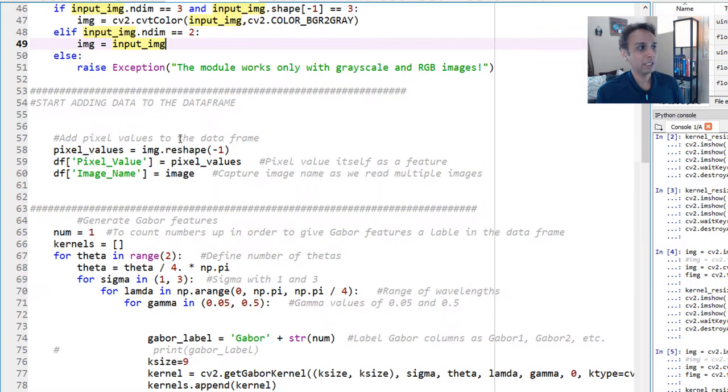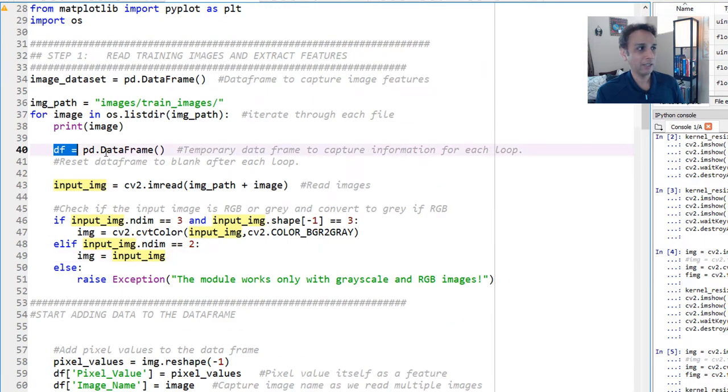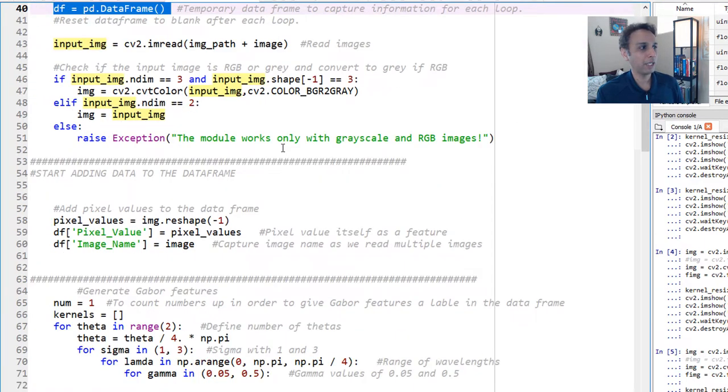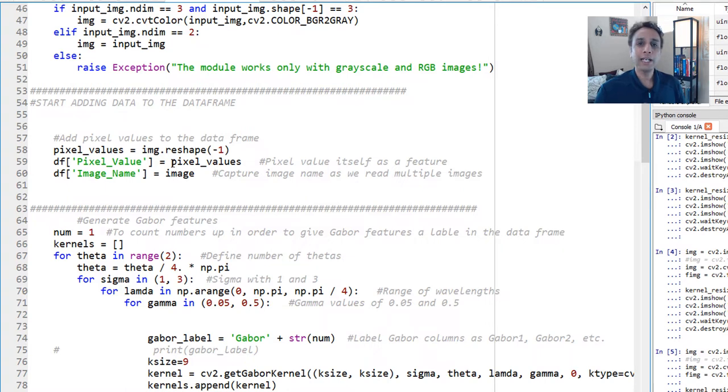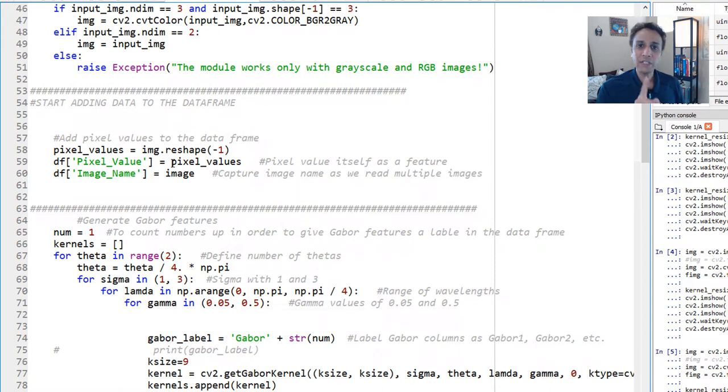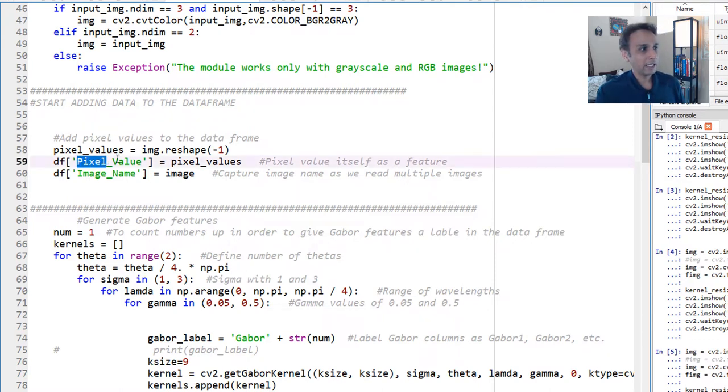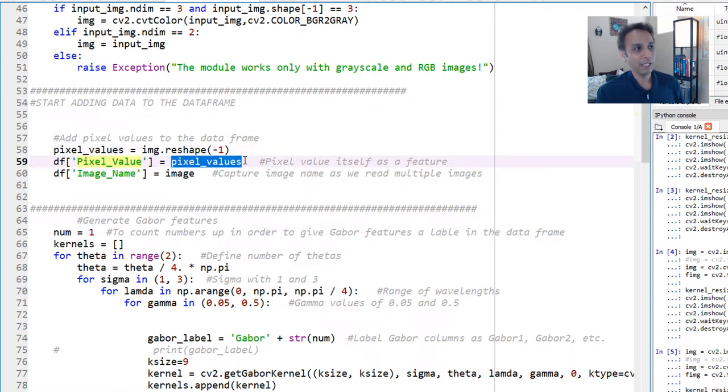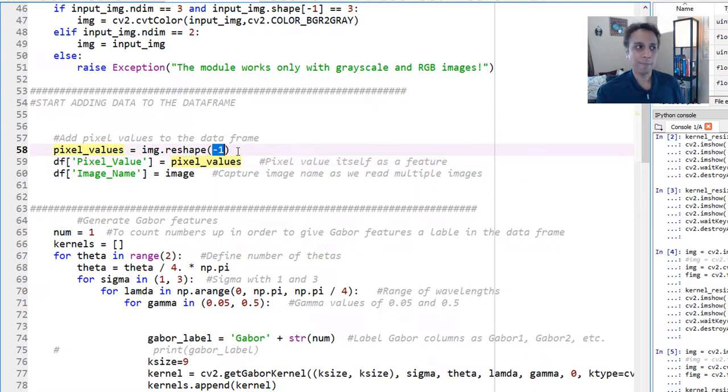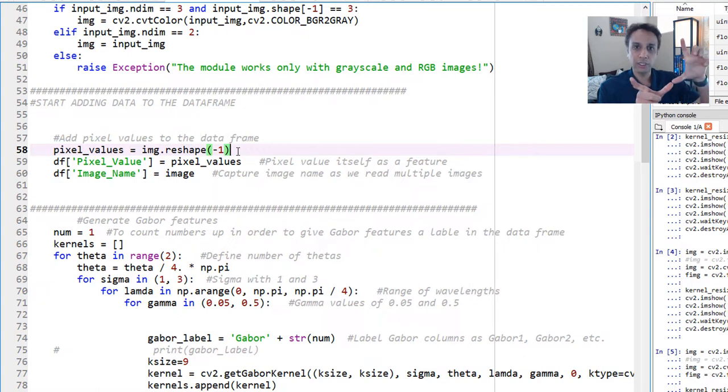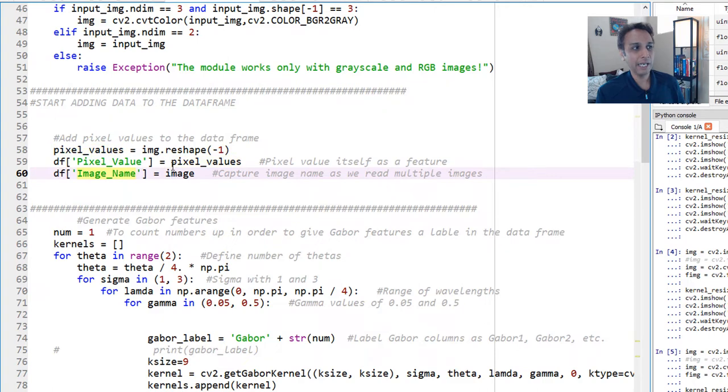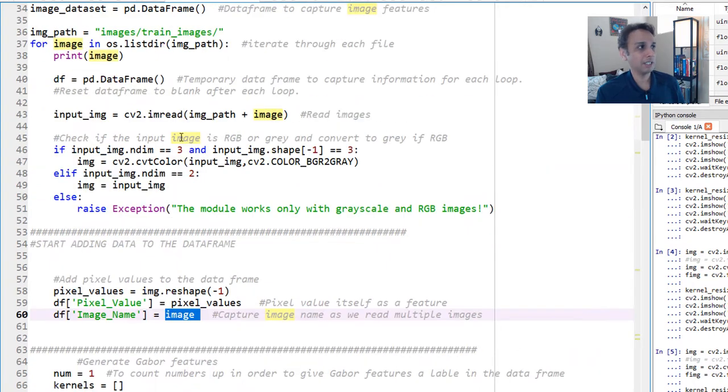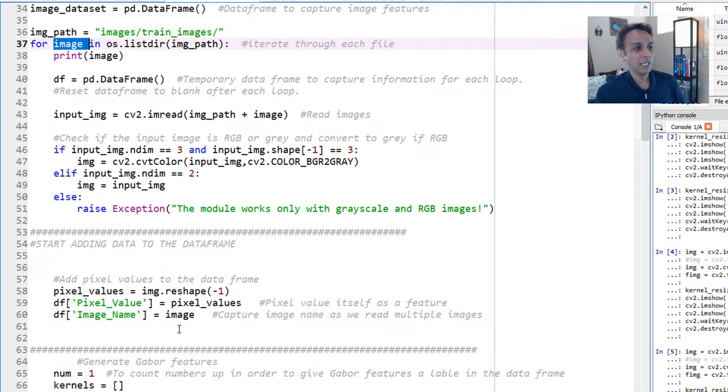Now that we have that, let's start adding data to the data frame. Which data frame? The temporary data frame that we just created. So to this data frame, I'm going to add some data. What do I want to add? First of all, the pixel value itself is a great feature. So let's add pixel values. And everything, we are capturing it as individual columns. For each feature, all the values are in individual columns. So this creates a column called pixel value and adds all the pixel values. By the way, I reshaped the image to a single column. So when you do minus one, that's what it does. Otherwise, your image is your height and width, the two-dimensional data set or NumPy array.